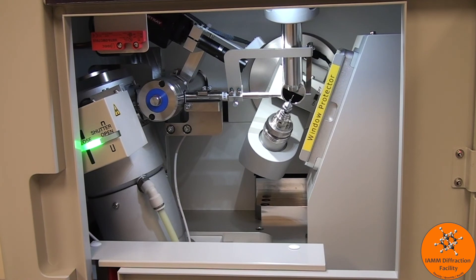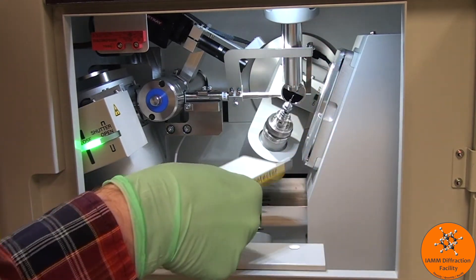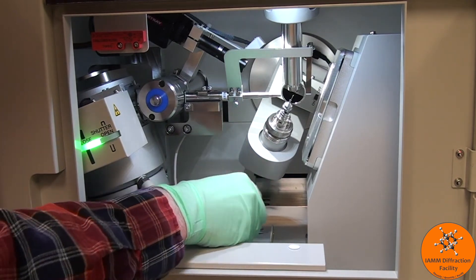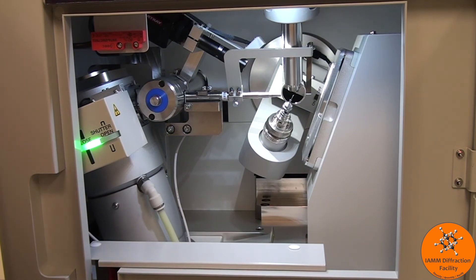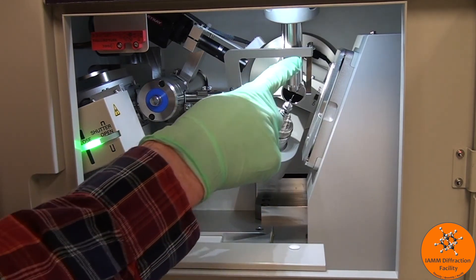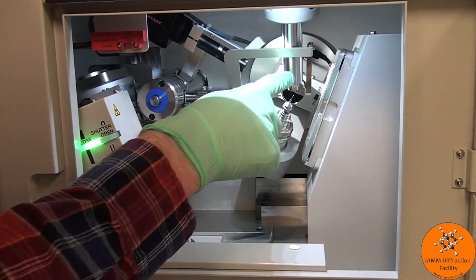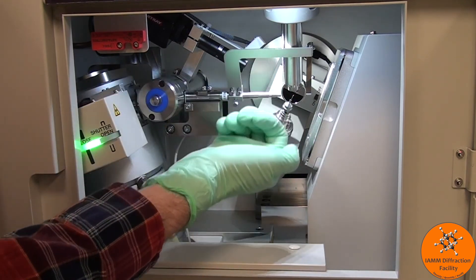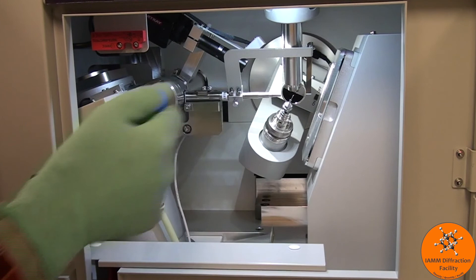Once our crystal is well aligned, we can remove our window protector. One thing that you want to make sure of is that this is all the way up and touching the nozzle. It shouldn't ever move, but if it ever looks like this is tilted a little bit, then gently push it up until it is in contact with the cooling nozzle.